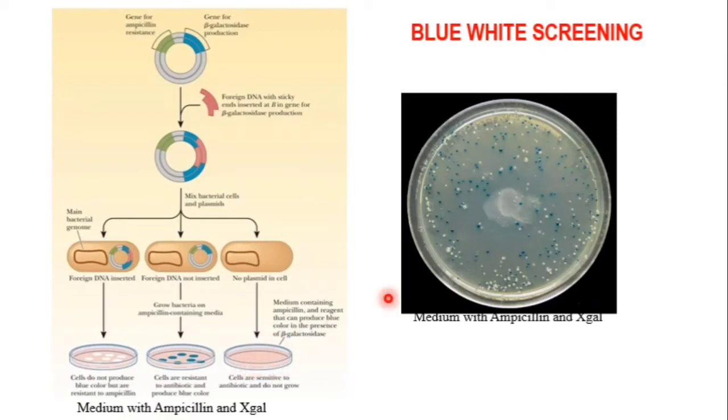Here you can see this is a blue colored colony. This blue colored colony is because the foreign DNA is not inserted in the lacZ gene.